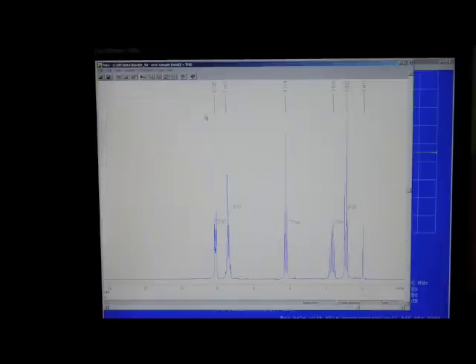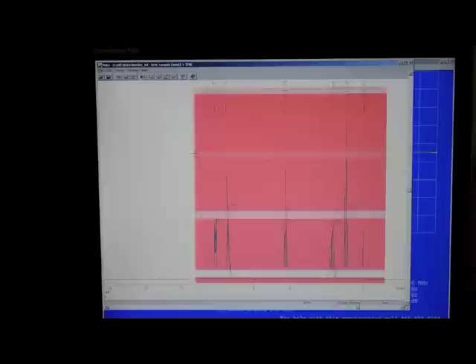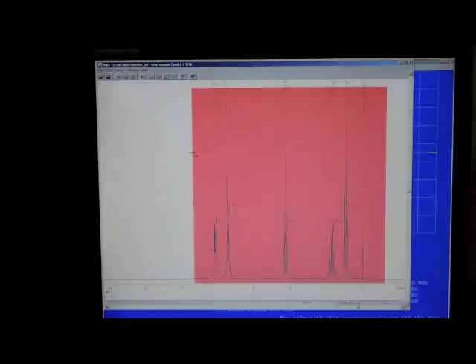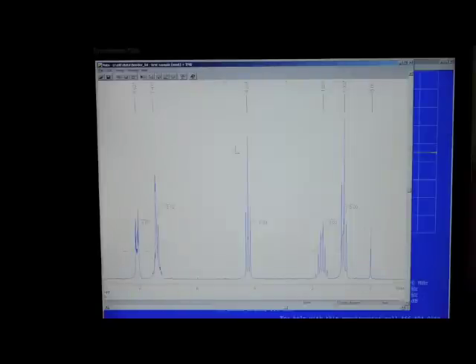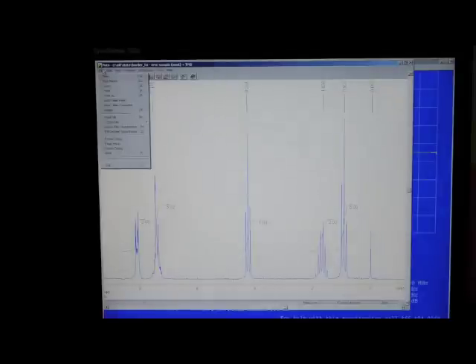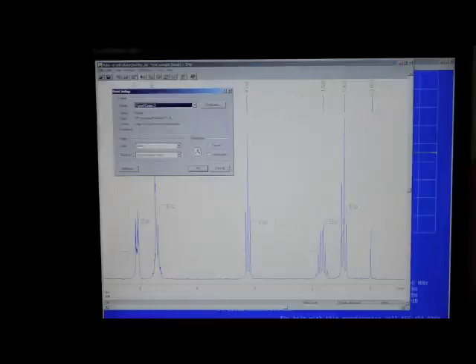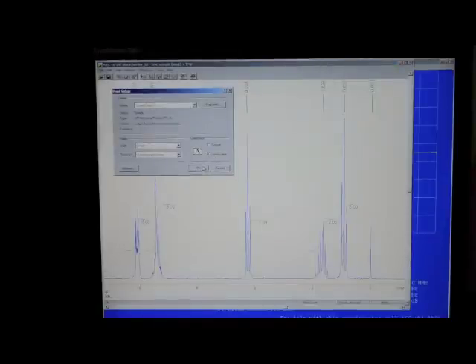Next, double click on the screen to invoke the zoom routine. Drag across the part of the spectrum that contains peaks and then right click to zoom to this part of the spectrum. When your spectrum looks the way that you want it, you should print it. Select Print in the File menu, choose Landscape if it is not already selected, and print to the CREPO3 printer.